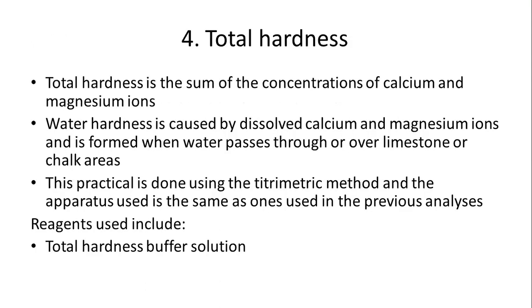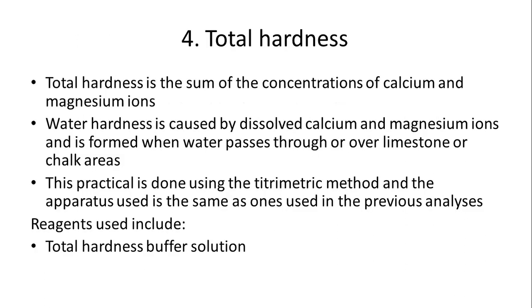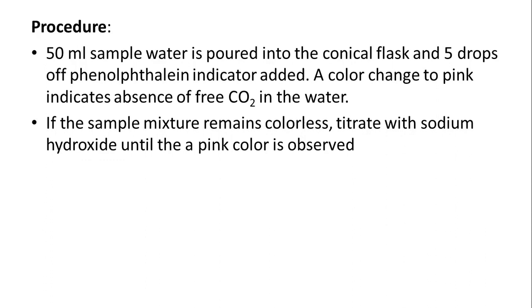We don't have values for free CO2 in water as recorded by WHO, but basically with free CO2, we just want to see how acidic your water is. Again, as with the parameters tested before, you will get your data value and then you multiply it by 20.